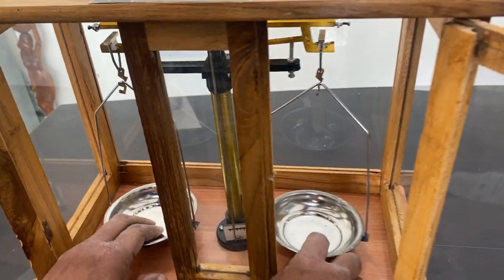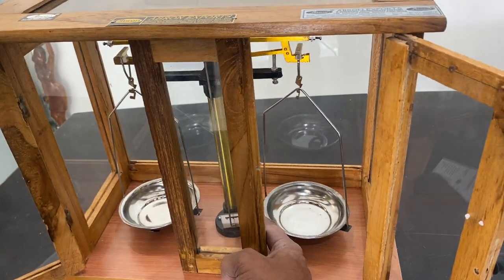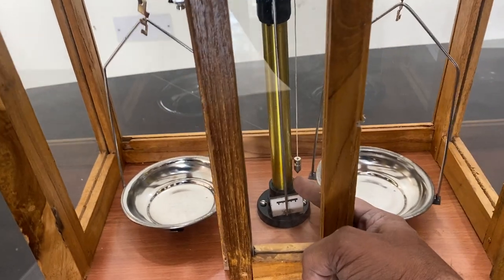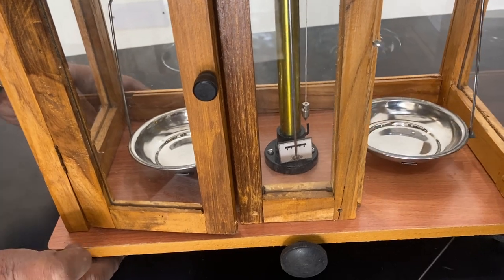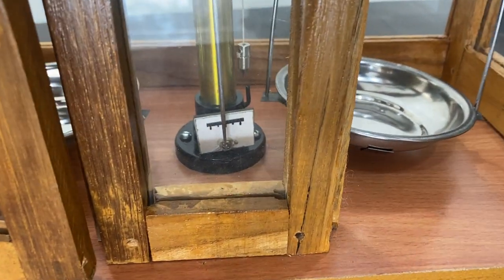Now I hold it. See, the plumb line is not matching - it's a little to the left side. So I slowly adjust the height, and now the plumb line is coming to the center.